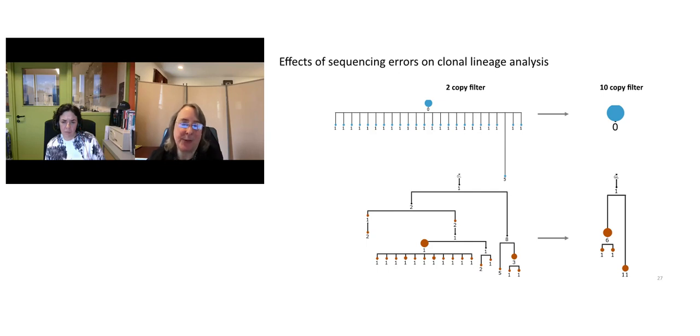The way these trees work is the sequence on the top is the germline V gene sequence, which can either be an inferred node, which would be in black, or a colored node. In this case, it means we have data at the germline V gene sequence. And then down from that node, you see all these individual sequence variants that are all 1 nucleotide away, and they all have tiny little circles too, which is another tip off, right?